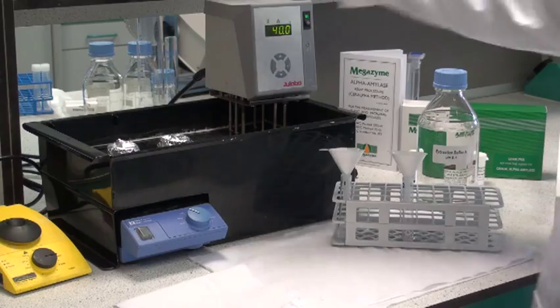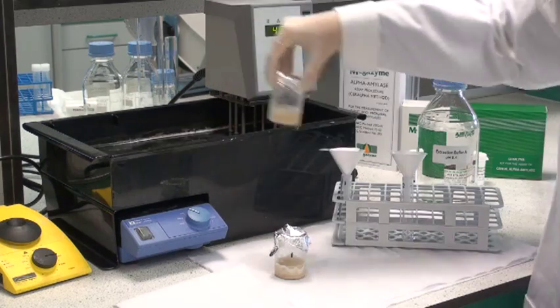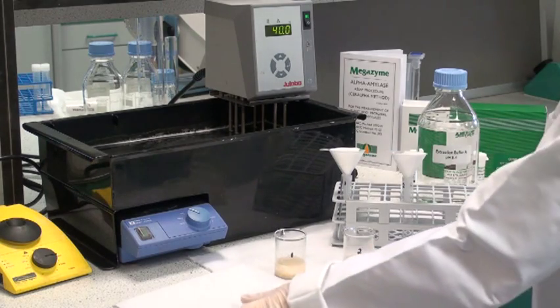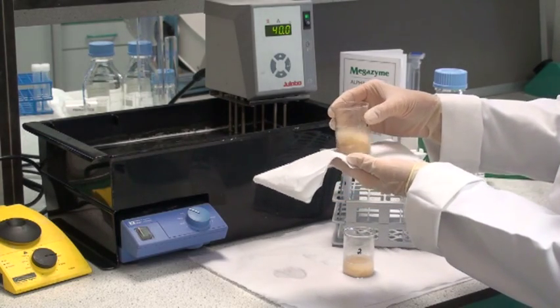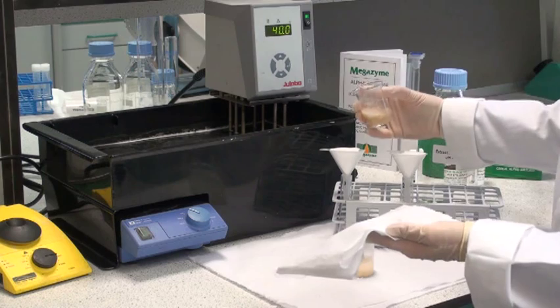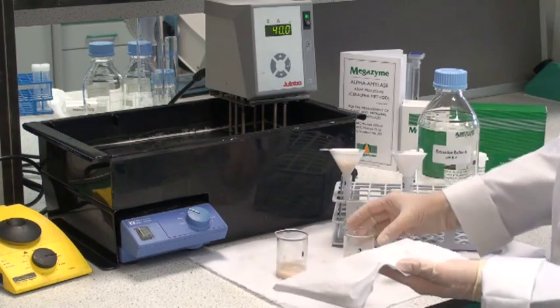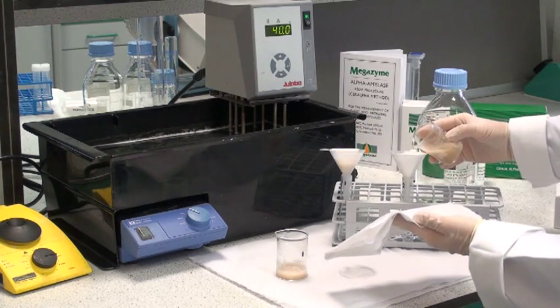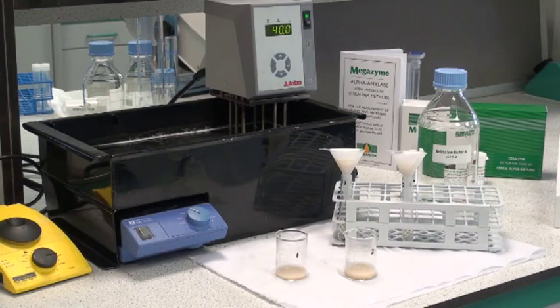Remove the beakers from the water bath and place onto absorbent paper. Remove the tin foil covering, and then mop up the water on the outside of the beaker so this doesn't run into the filter paper at the next step. Now filter the solution through glass fibre filter paper. Filtration takes approximately 5 minutes and the filtrate is used directly in the assay.